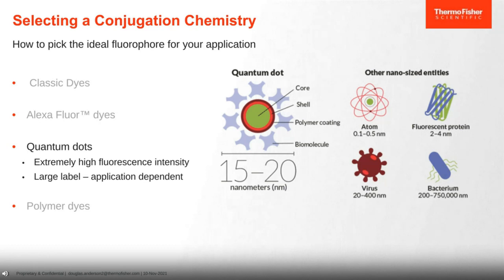I've actually recently made a conjugate this way where we had a viral coat protein that only had 50 copies per virus, and the only way we could get any signal and actually detect these targets was with a quantum dot. So although these quantum dots have been on the market for 10, 15 years now, and they do have limitations, if you're in a situation where you can make the best of them, they're still extremely useful and definitely worth considering.